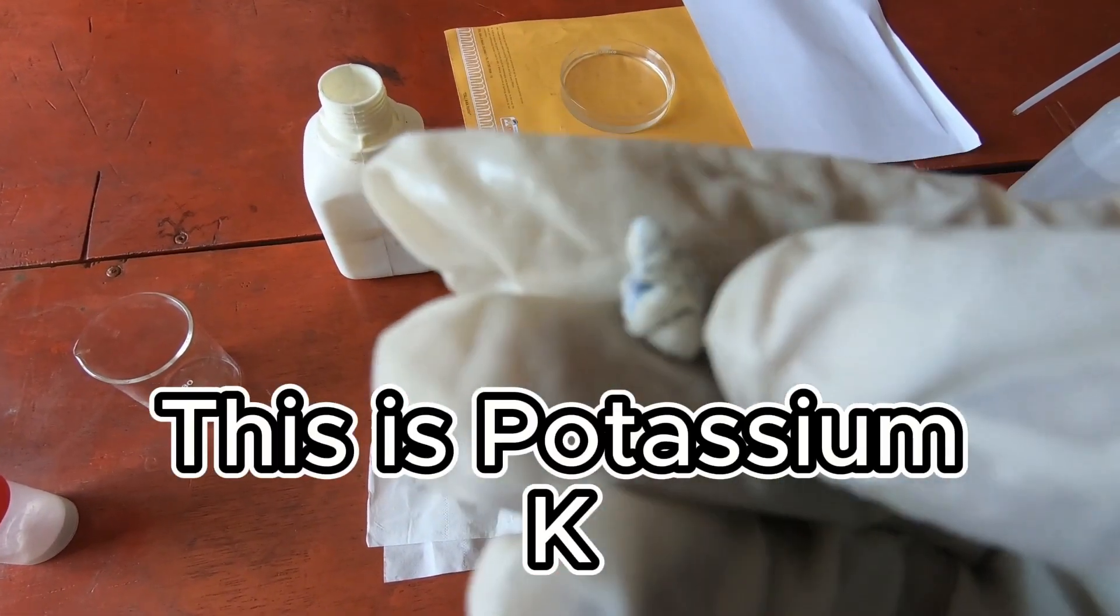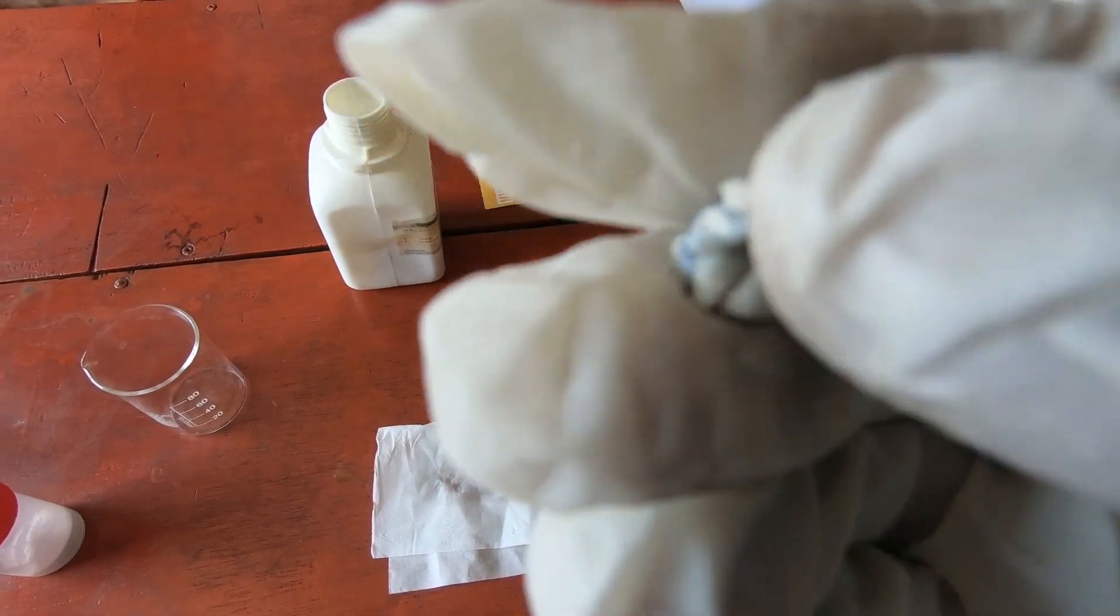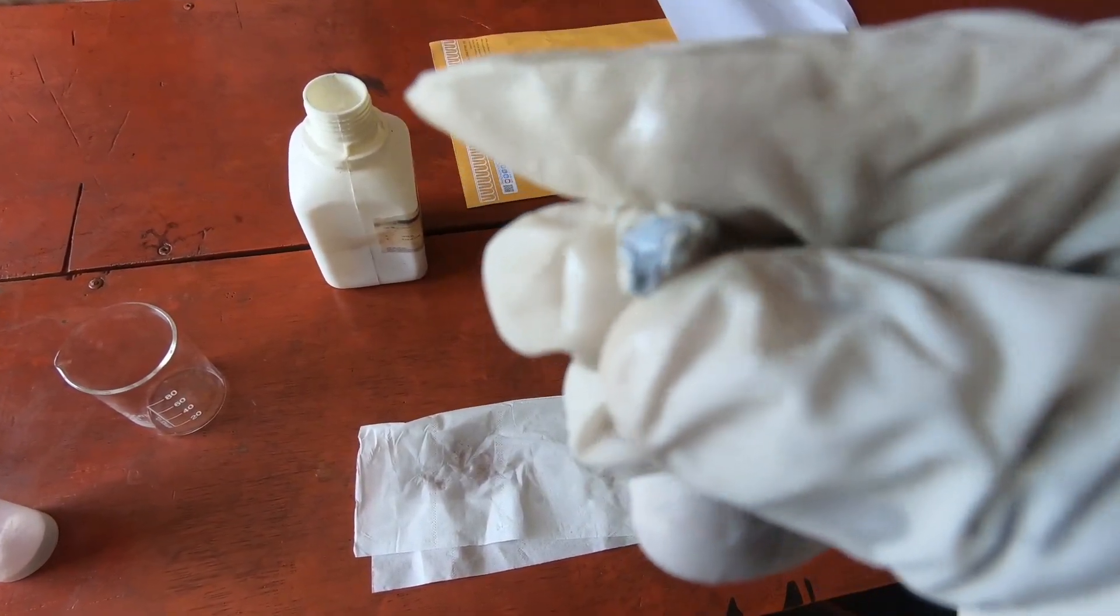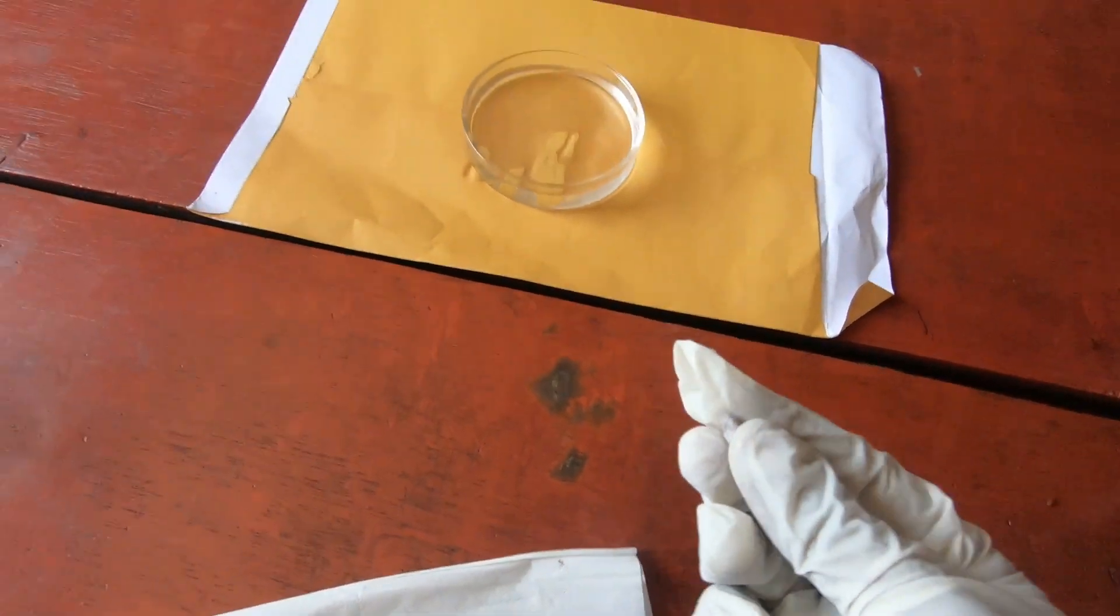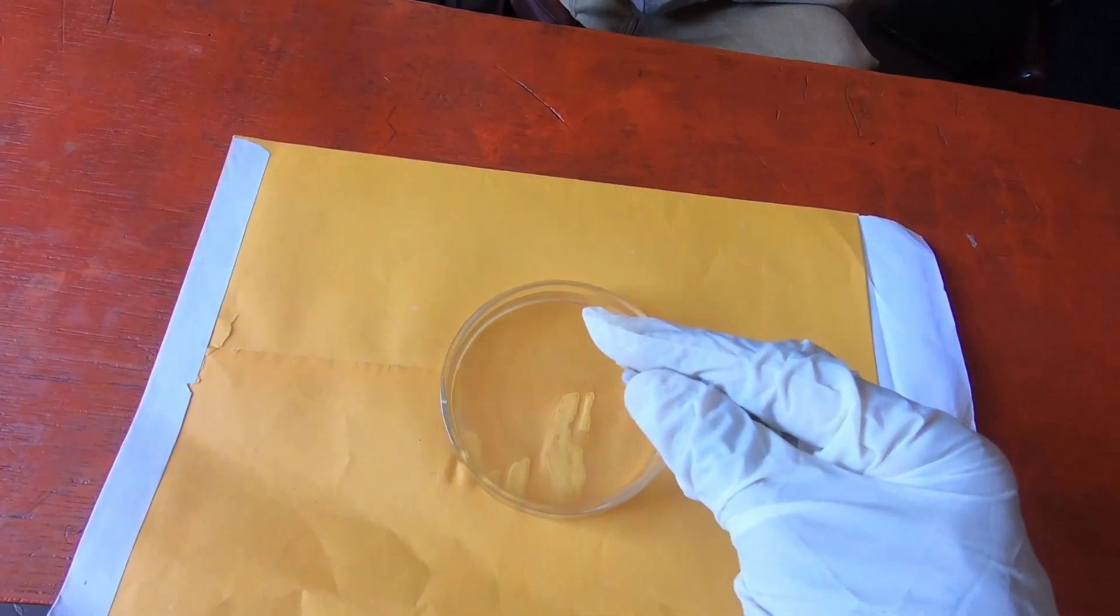Both sodium and potassium are very soft metals. We can easily cut them using a knife. Here I have used a scissor to cut them. The reactivity increases down the group and we know that the softness increases down the group as well.